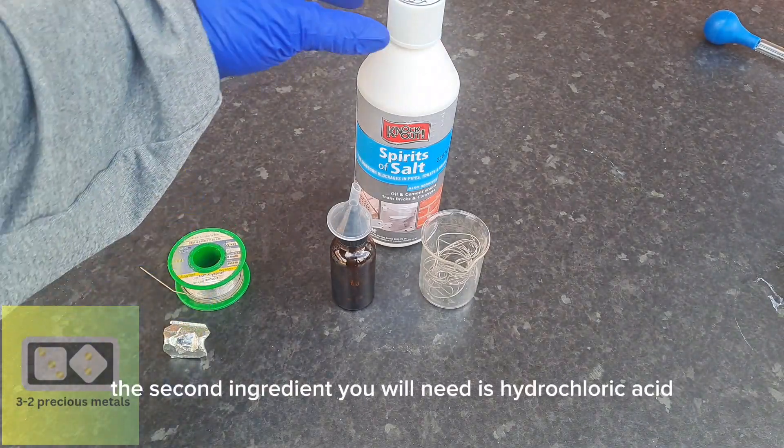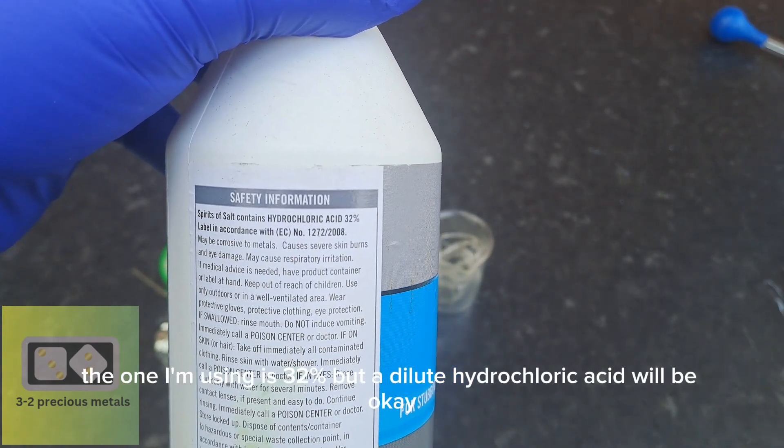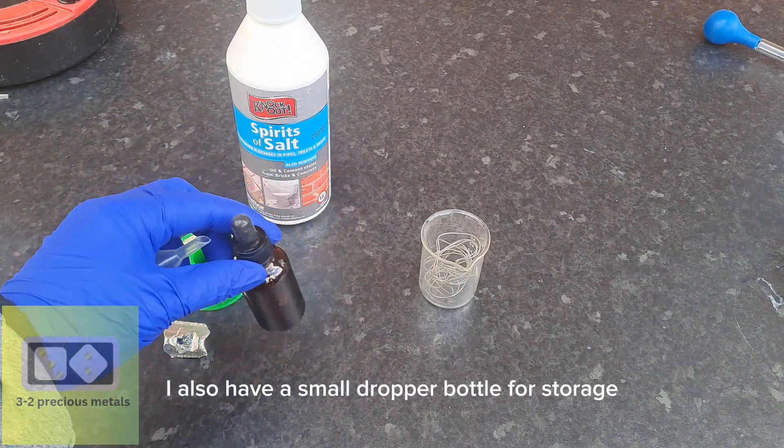The second ingredient you will need is hydrochloric acid. The one I'm using is 32%, but a dilute hydrochloric acid will be okay. I also have a small dropper bottle for storage.